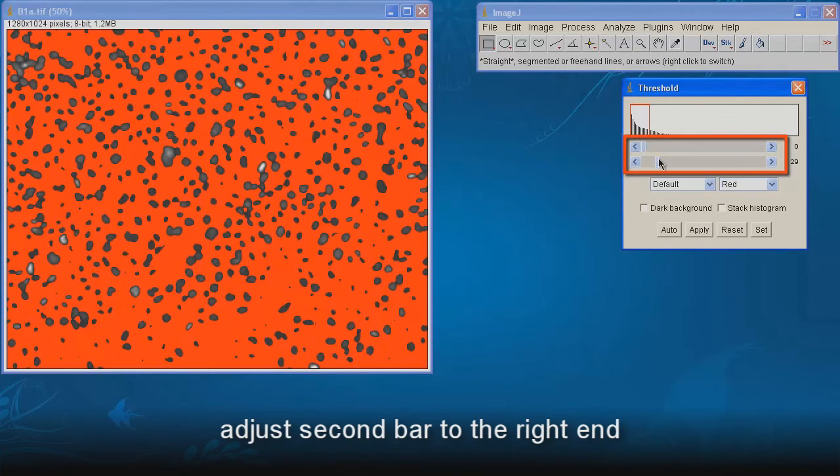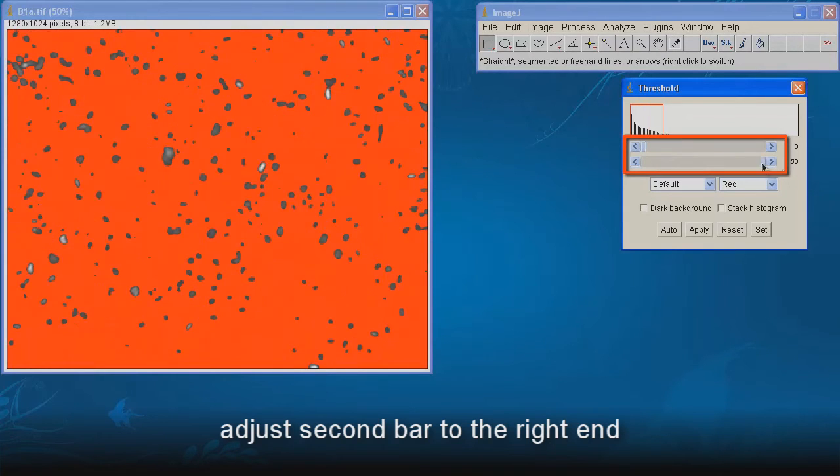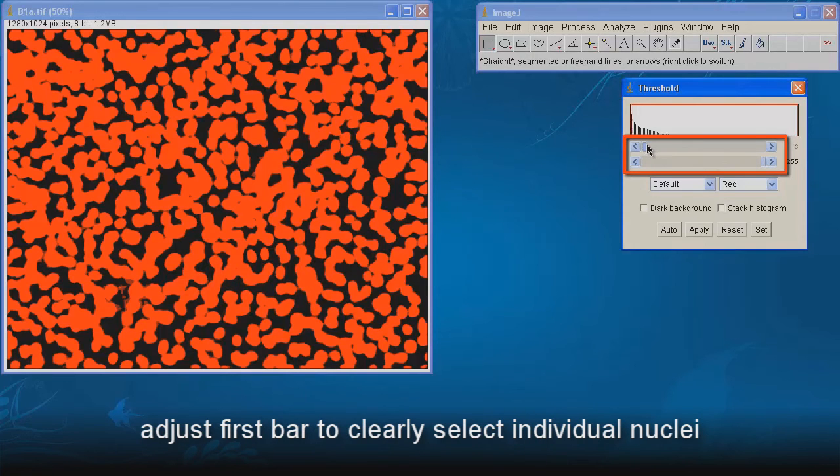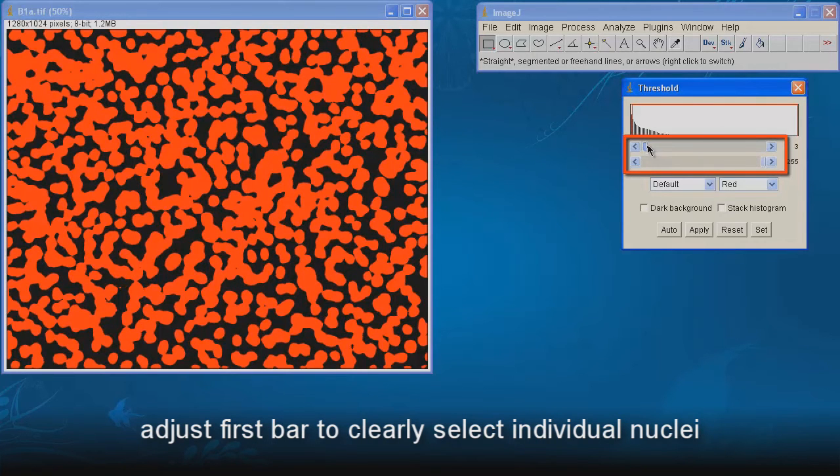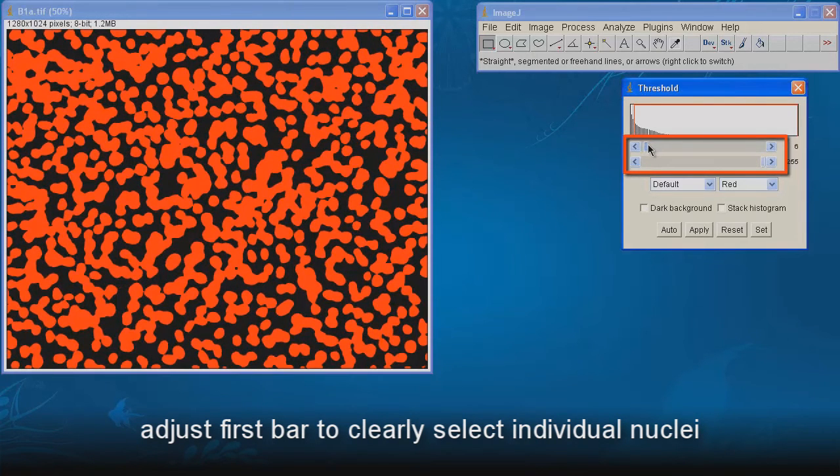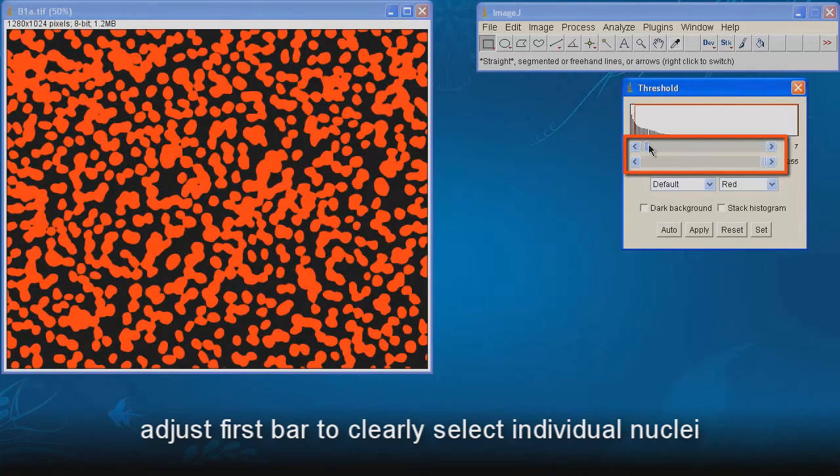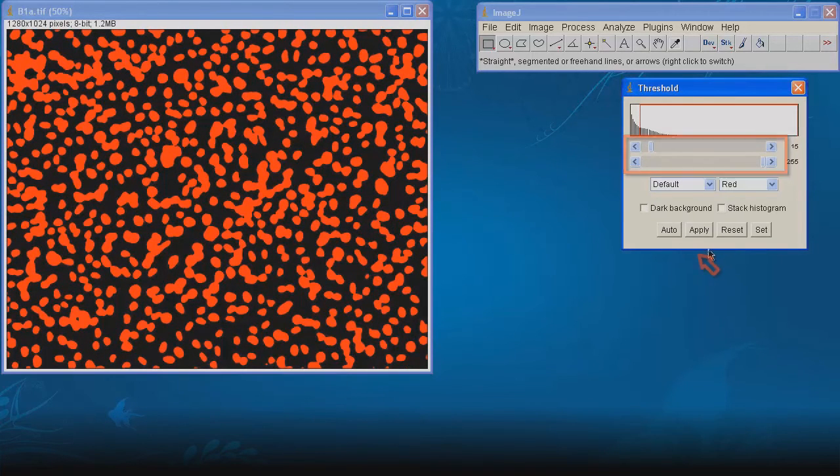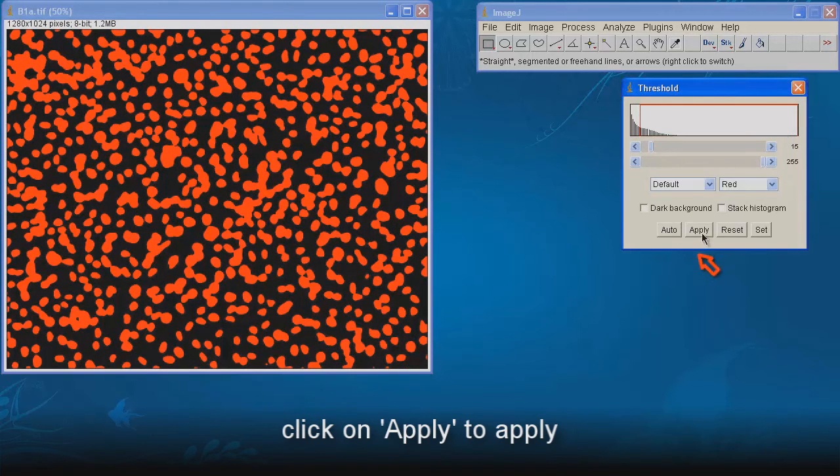Adjust second bar to the right end. Adjust first bar to clearly select individual nuclei. Try to reduce the linkages between neighboring nuclei. Click on Apply to apply.